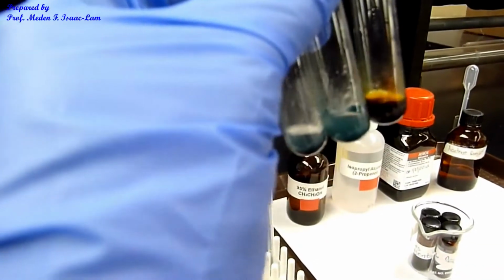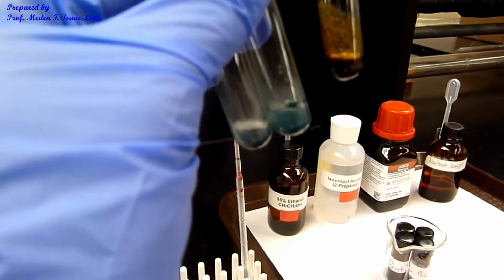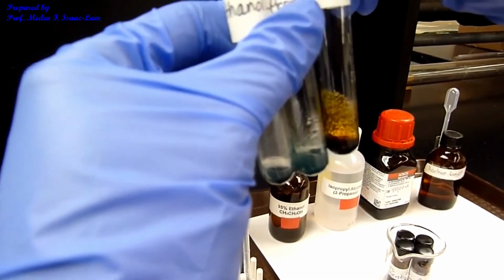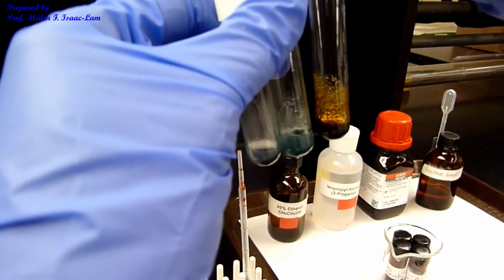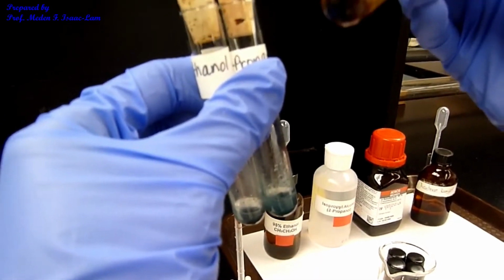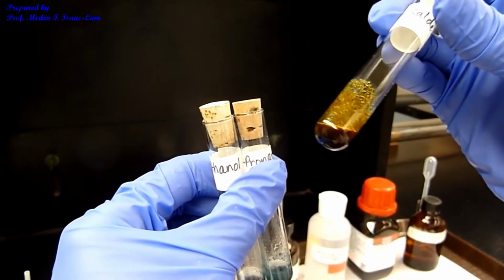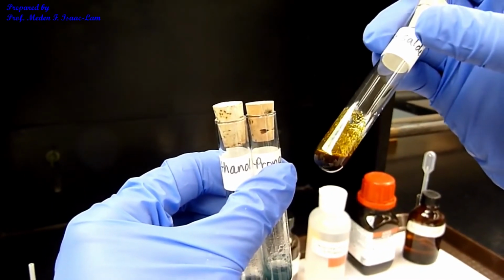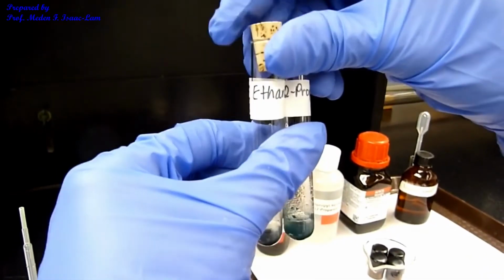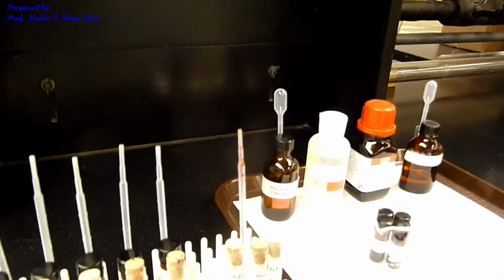However, the anisaldehyde, it did not pop. Okay, so it did not change color. But we let it sit. So basically, these 2 reacted fast. However, it's turning color, as you can see, but it's slow. So the aldehydes will react, but slower than the alcohols. So primary alcohol, and then secondary alcohol, ethanol, and 2-propanol. So those are the standard.